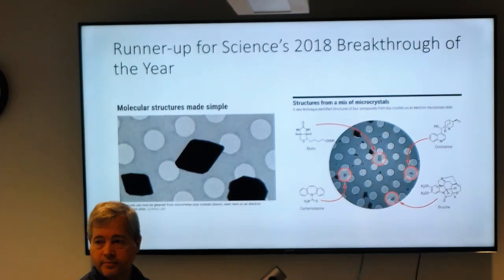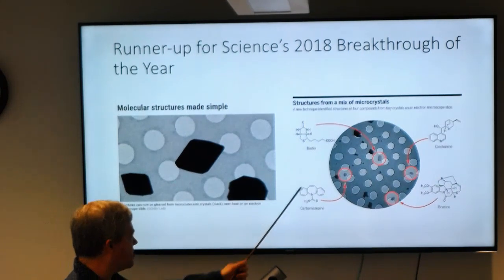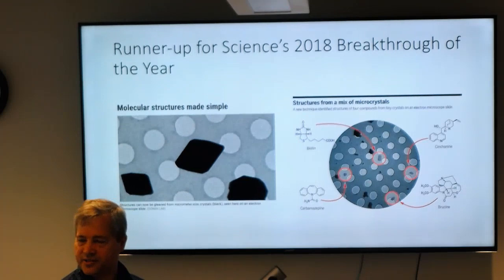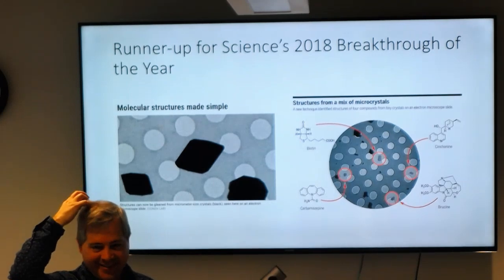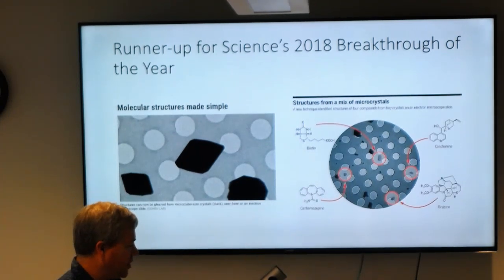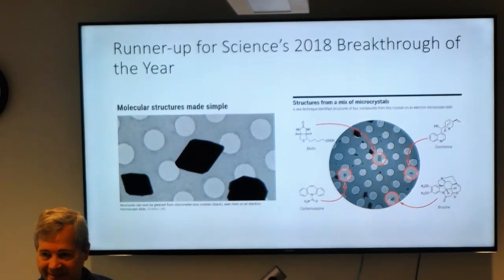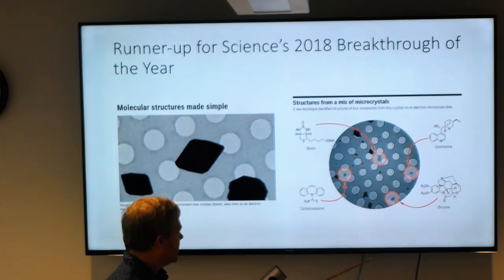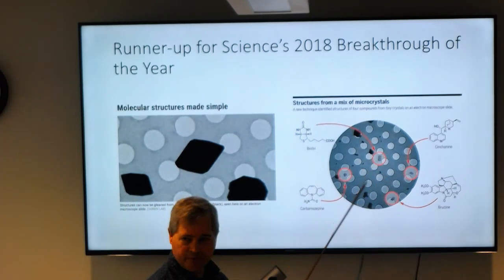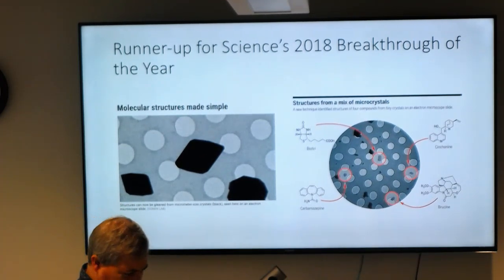So why do they put them on holey carbon? Why not just use continuous carbon? Holes aren't useful, right? Yeah, I don't know why, because this is done at room temperature, so the holes aren't actually useful. It might just be they have a lot of Quantifoil grids. Or have some plain carbon. We were doing it on C-flat grids, which are holey, but they're thin. So if you use a C-flat, you have nice thin carbon. You might as well just make thin carbon. That's true. I don't see a reason for holey carbon, because you're not imaging ones that happen to be half over a hole and half not. You image the ones over continuous carbon. You're just making it a lot harder. Anyway, curious. Force of habit, I guess.